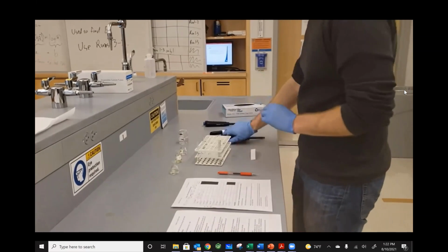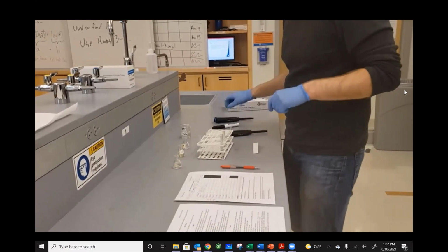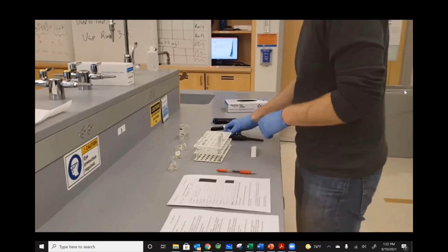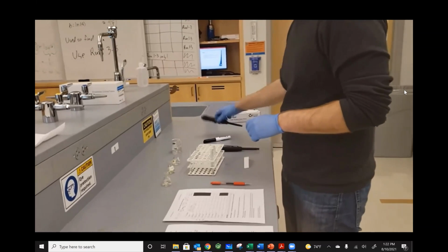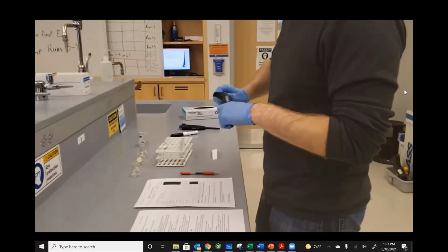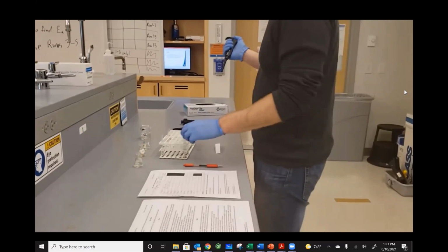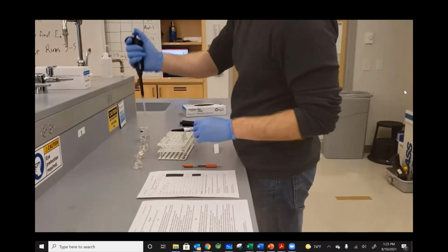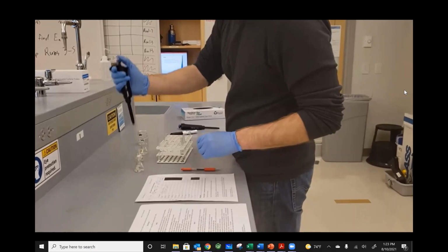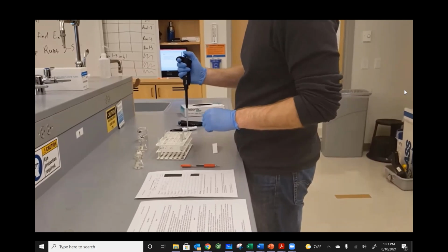This is our hydroiodic acid. This is our sulfur compound. This time for run 3, I need 800 microliters of hydrogen peroxide. 800 microliters to run through the test tube.